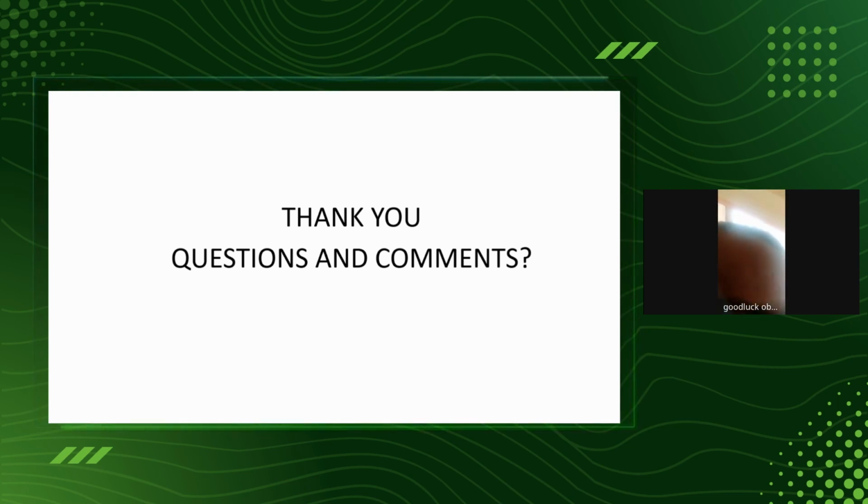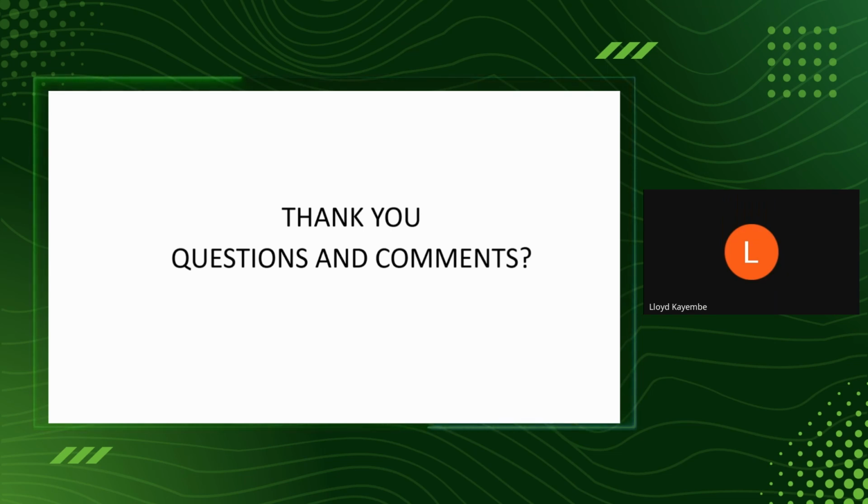Thank you so much for that question. I hope our engineers took note of that. He actually said that if an autoclave is just jumping phases, what can you do? Engineer Dan, you have raised your hand. Please take the question. Thank you very much.